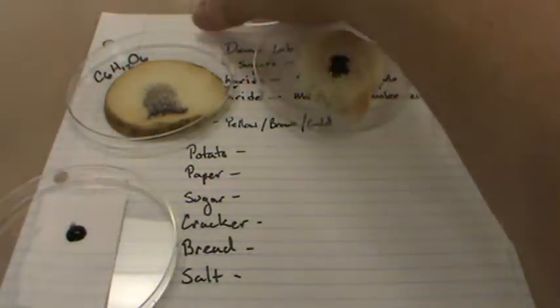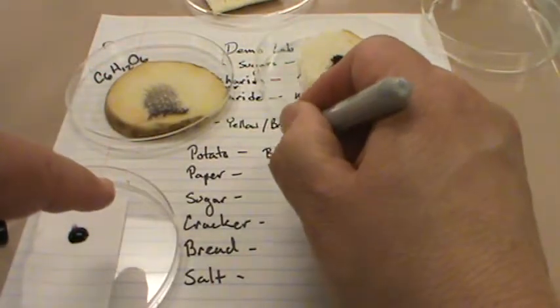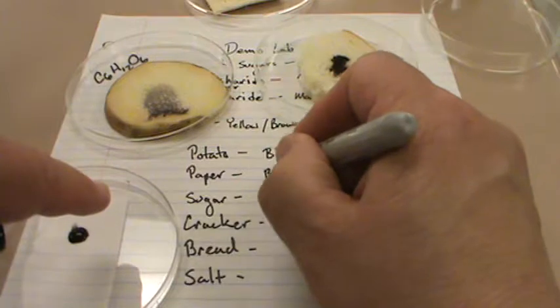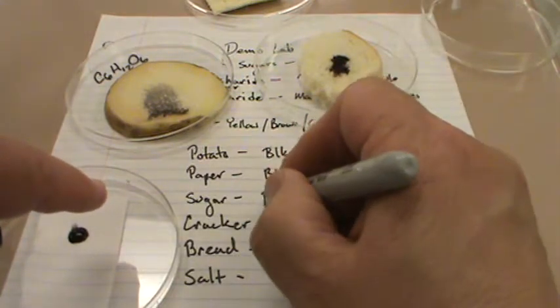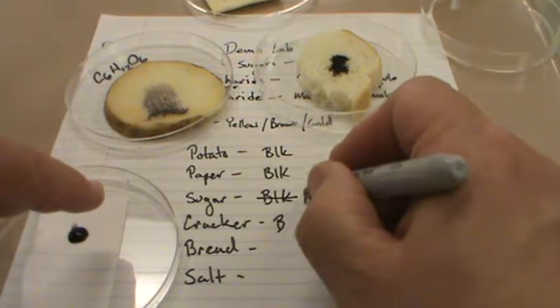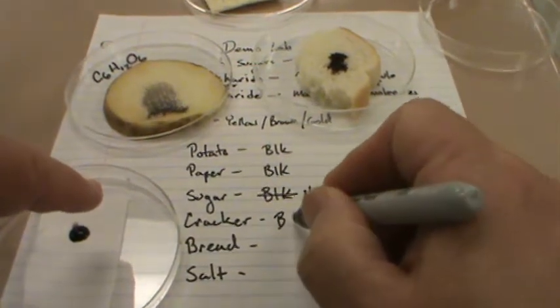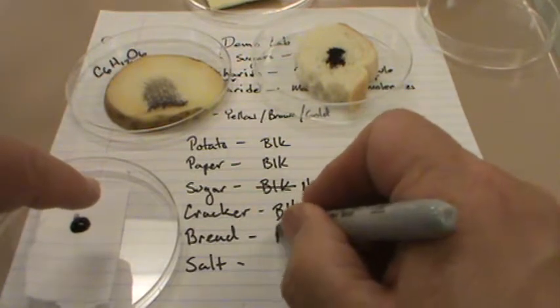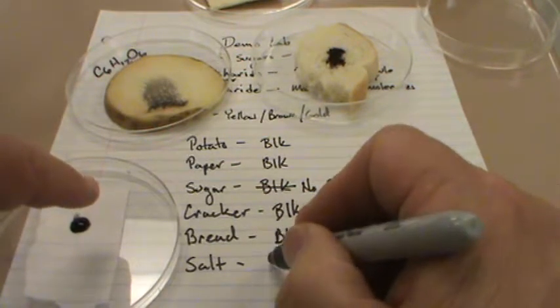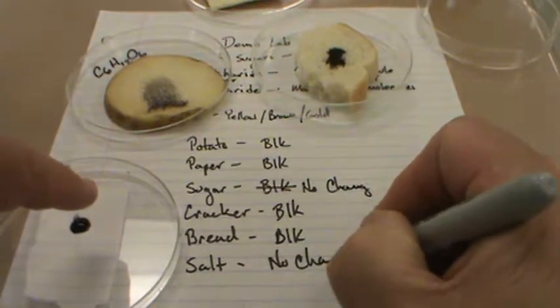So on the paper, we put down here that the potato turned black, the paper turned black, BLK, the sugar did not change, there was no change, sorry about that. The cracker turned black, the bread turned black, and the salt, there was no change.